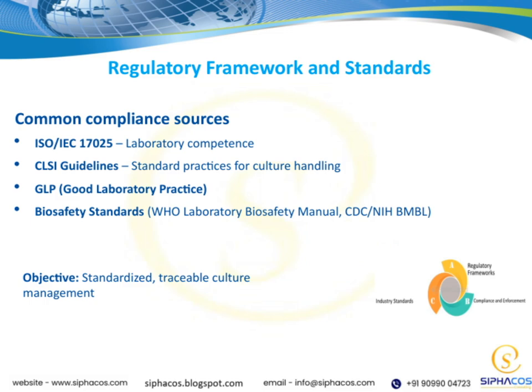We also prioritize biosafety standards, referencing manuals like the WHO Laboratory Biosafety Manual and the CDC NIH BMBL, to keep our staff and environment safe while working with potentially hazardous materials. All of these elements together form a comprehensive framework. They not only help us maintain high-quality, reliable culture management, but also ensure compliance with regulations. By integrating these standards into our daily practices, we reinforce the overall theme of quality, safety, and traceability in our work.